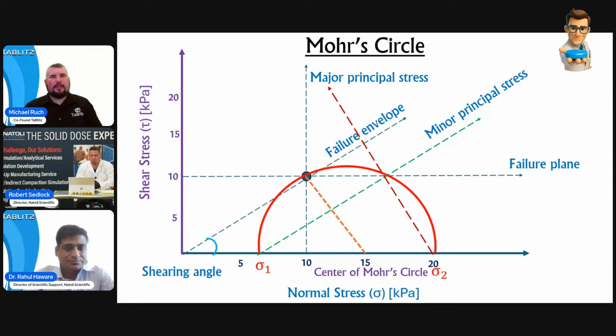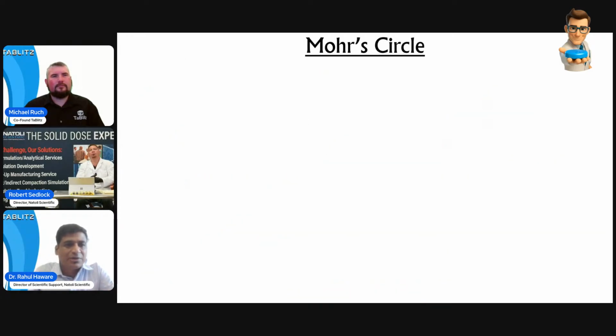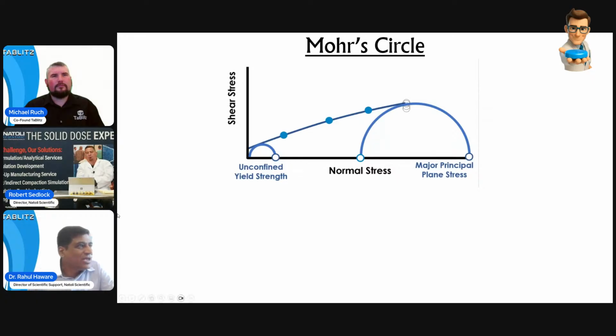So you're saying it's important to run multiple pressures in increments, so that you can normalize what the actual powder behavior is by fitting the rest of the data together. Absolutely. And please keep in mind, everything is in kilopascal, not megapascal. Yes, a very, very small amount of pressure. And if, at that small amount of pressure, the powder is still creating a problem, then definitely we need to think about it. So as you can see here, there are 1, 2, 3, 4, and 5. And that's the point Michael was making here.